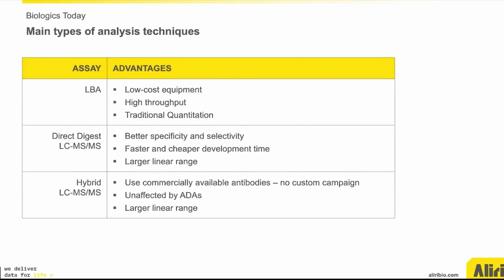Regardless of the methodology used, it is essential to employ well-characterized, fully validated bioanalytical methods to ensure reliable results. This will allow for critical go, no-go decisions along the drug development pathway.